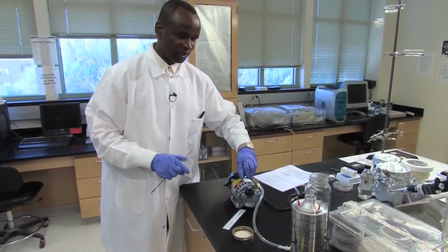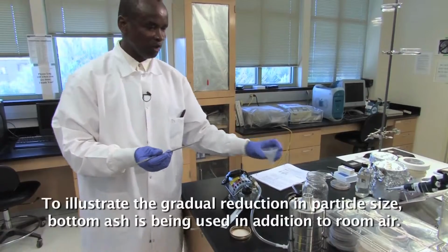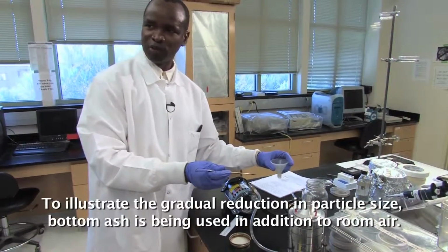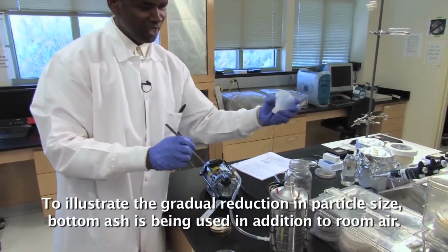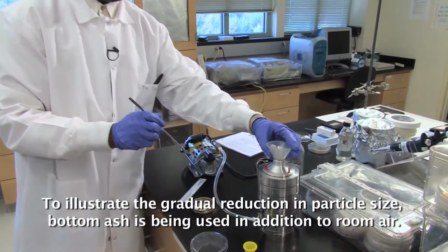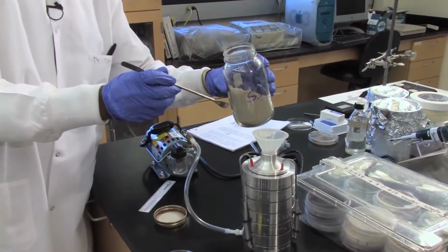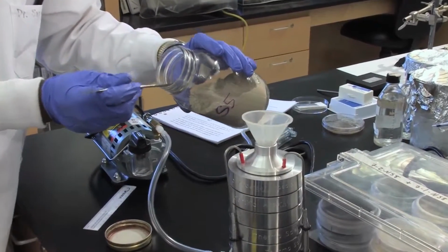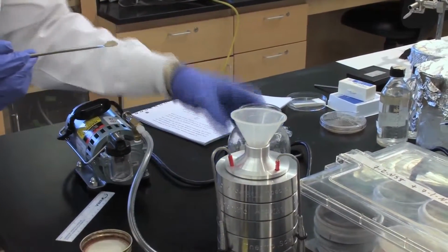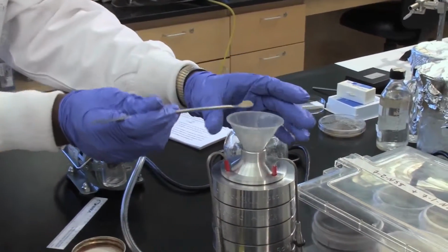So we'll create a vacuum through the system, and I'm going to dispense a little bit of a sample through the orifice, but it helps to put a funnel over here so that it will channel the sample in properly. So we're talking about 0.33 milligram that you can put at one time.